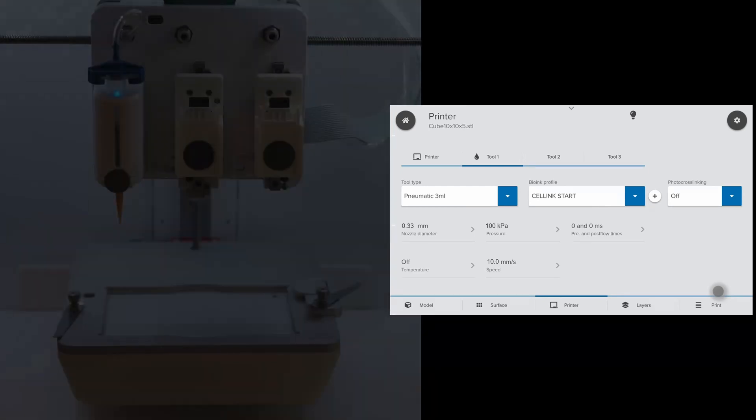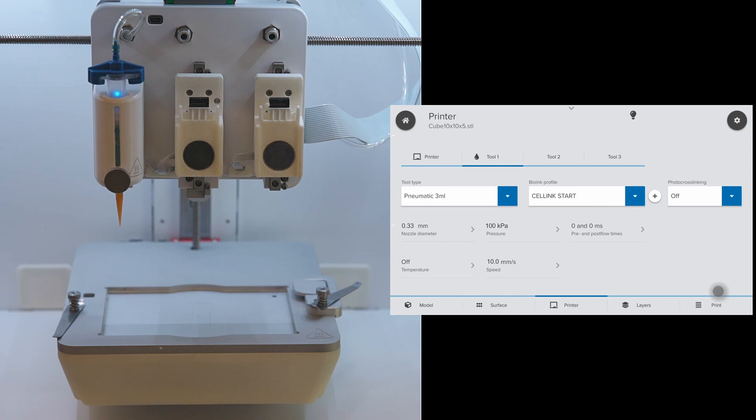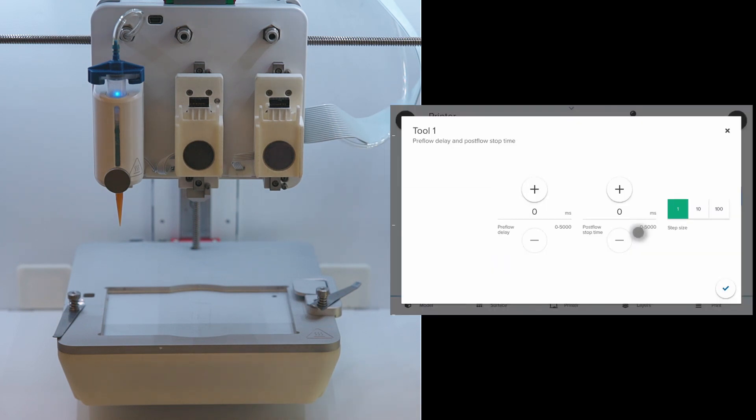Remember, the extrusion pressure and printing speed are dependent on each other and in turn dependent on the needle diameter and ink material. So these values may or may not work with another ink material.